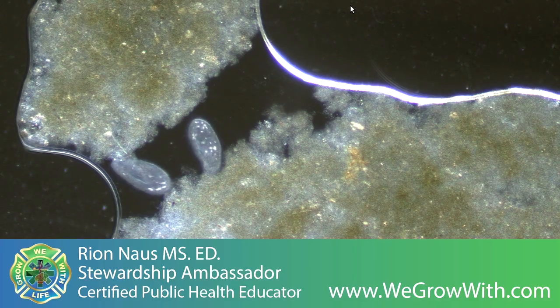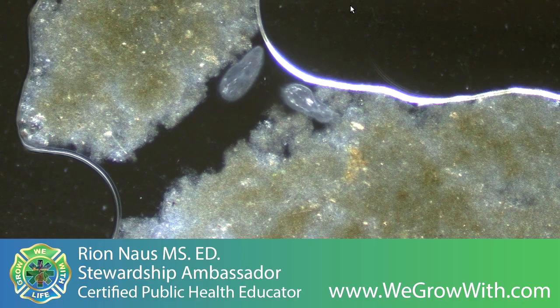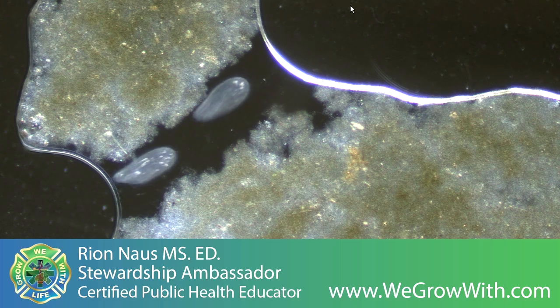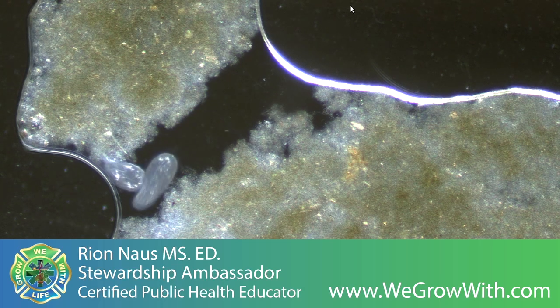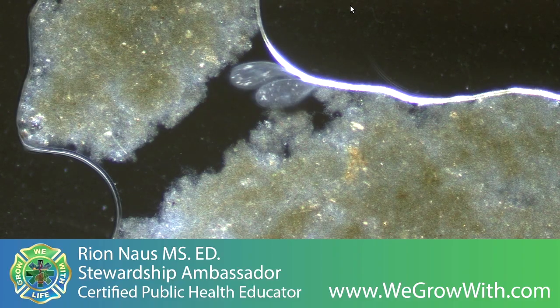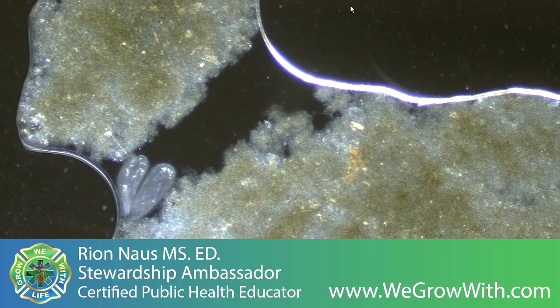You can see what looks like other creatures large enough to be motile. I don't know. It actually might just be because of the compression in there, that the vortices coming off all those hairs are drawing in. We're actually seeing it able to draw in from different directions, or push off. Draw or draft.